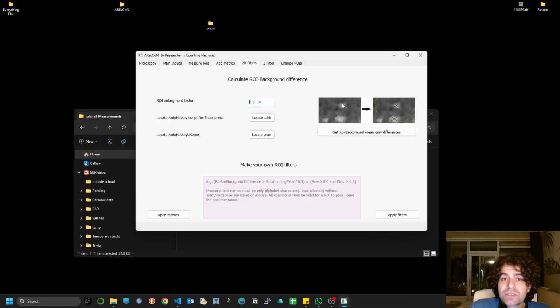What you can do is just set a crude filter saying that if the mean intensity of the pixels comprising this row is at least a certain number, then consider it an observation, otherwise do not consider it.